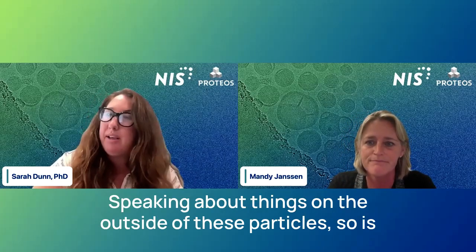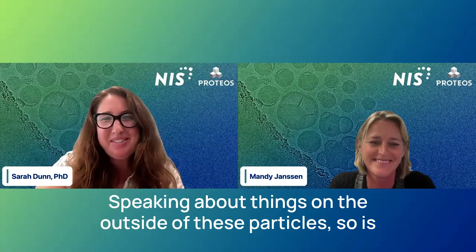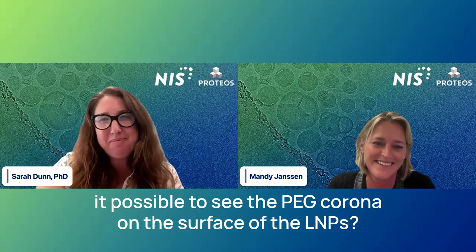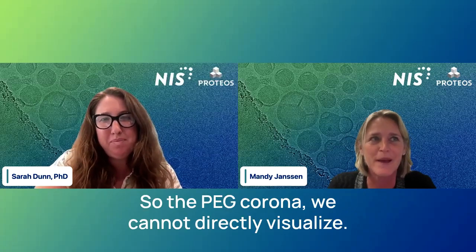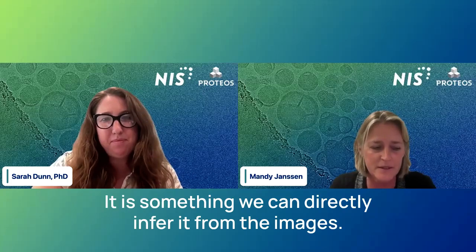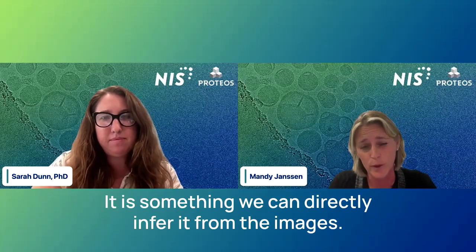Yeah. Speaking about things on the outside of these particles, is it possible to see the PEG corona on the surface of the LNPs? All right. So the PEG corona, we cannot directly visualize. It is something we can infer from the images.